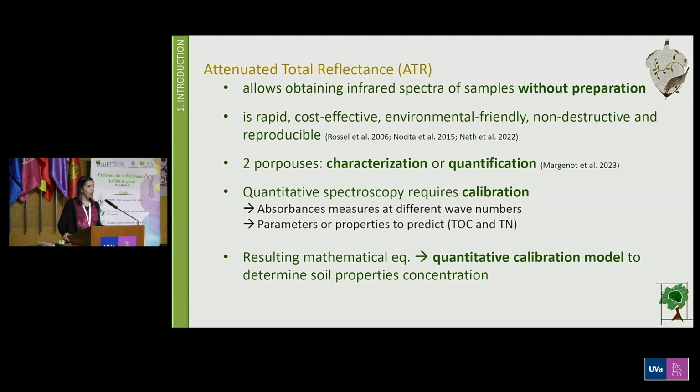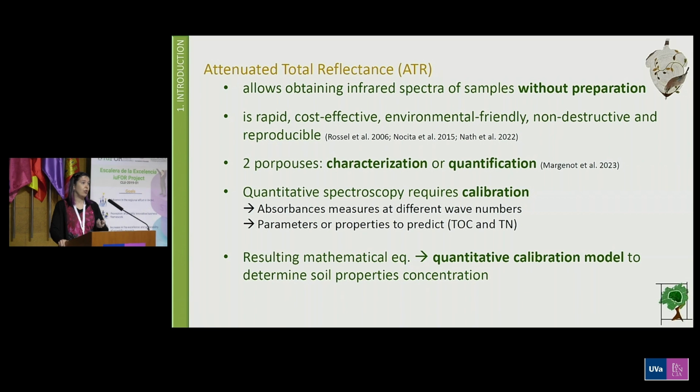the MIR region and allows obtaining infrared spectra of samples without preparation. We just need to have the samples milled, and that's it. This technique is rapid, cost-effective, environmentally friendly, non-destructive, and reproducible. And it's very common to do this type of work in soils.